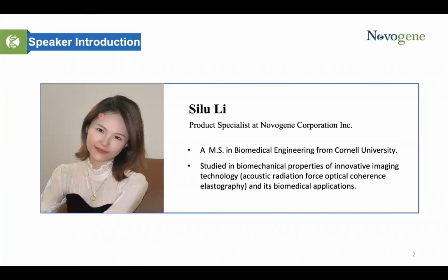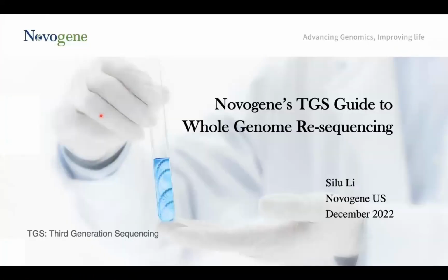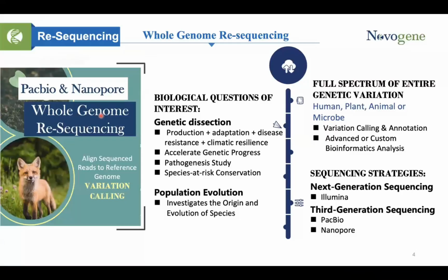We are all focused on third generation sequencing, TGS for short, and it's a guide to whole genome re-sequencing. So let's get started with a quick introduction of whole genome re-sequencing.